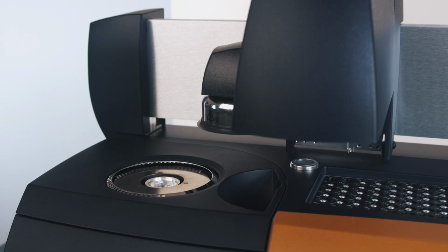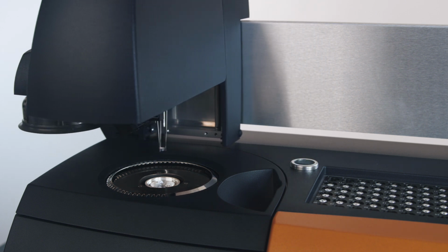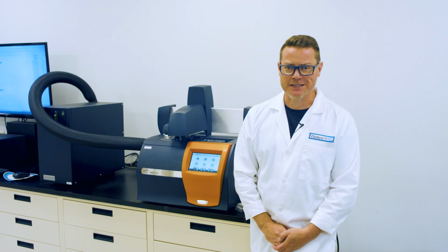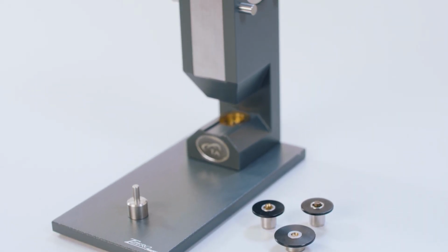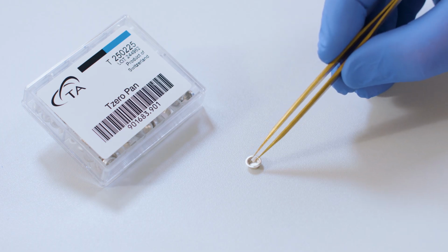It does, however, melt at 660 degrees centigrade, so I would suggest not using aluminium pans if you're heating to temperatures higher than that. Much better to use platinum or ceramic pans instead. Talk to your local applications specialist to see the full range of pans and lids available and their applications.